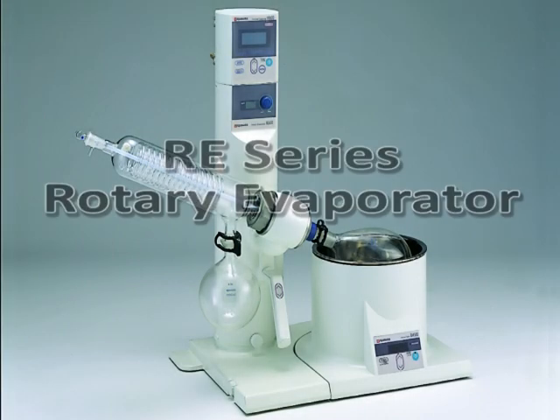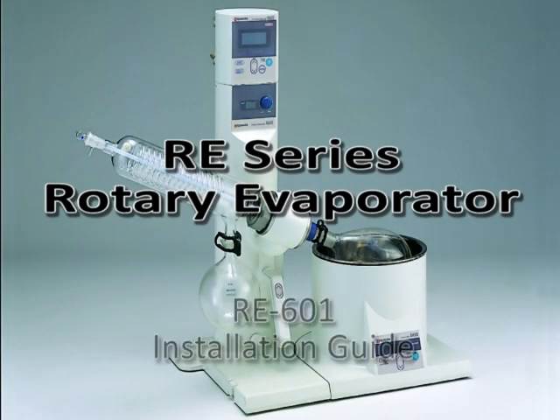Thank you for using the RE Series Rotary Evaporator. This video will cover basic installation of the RE601, the BM500 water bath, and glass or set A.